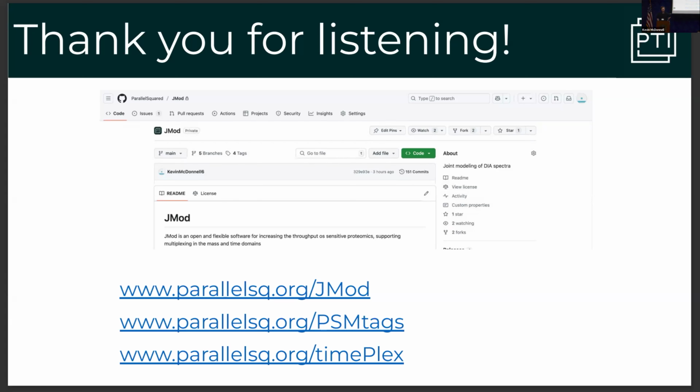Thank you, Catherine. Great talk and really impressive research. My question would be about if you've used MS1 and MS2 quantification, if you've also looked into MS2-based modeling, and if you have any expectations about how the more complex signal can actually help identification of these very lowly abundant peptides once we know that the signal doesn't come from 1 peptide copy, but actually from 27 peptide copies. How that helps identification? For example, yes. Kind of like stacking in TMT.